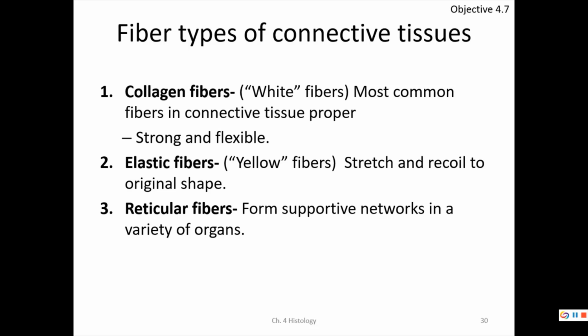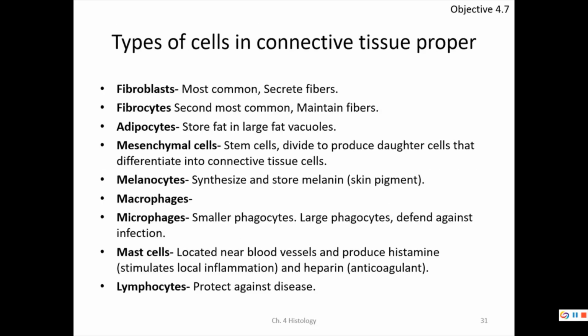Now, as we think about these three different fibers, we have the cells that are associated with connective tissue, which are also incredibly diverse. You notice that in epithelial tissues, they all kind of look the same. I mean, there are stem cells and mature cells, but there's not a good diversity. There might be a gland cell thrown in the mix, like a goblet cell, but the rest of it is pretty low in diversity of cell type. But here we can have many types of cells.